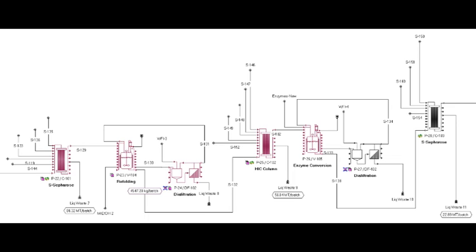Operation Unit 27, Diafiltration DF102. The enzymatic conversion solution is exchanged with WFI and concentrated by a factor of 4 in a diafilter. Operation Unit 28, Column C103.